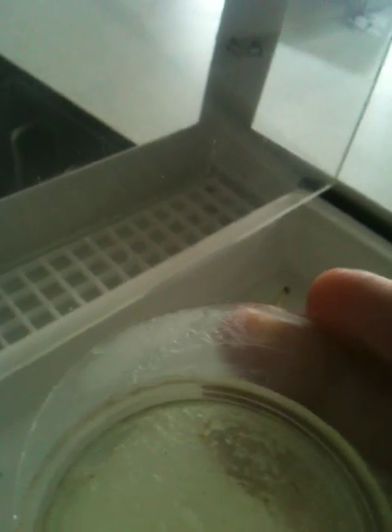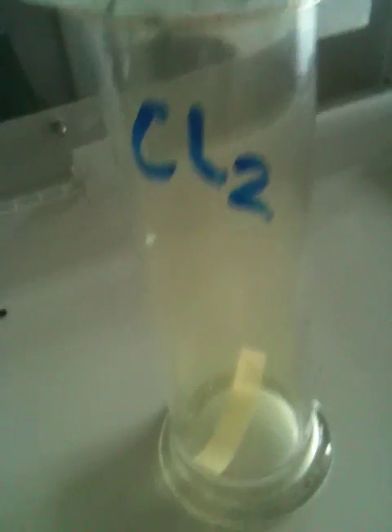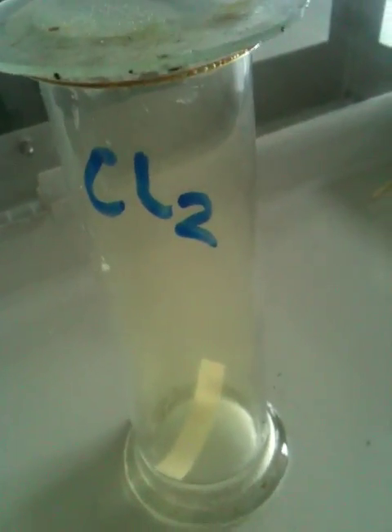What I'm going to do is lift this up very carefully, drop the damp litmus paper in like that. Hopefully you can see that it's gone quite quickly — it went kind of red and now it's bleached. So chlorine is an acidic gas which then bleaches stuff.